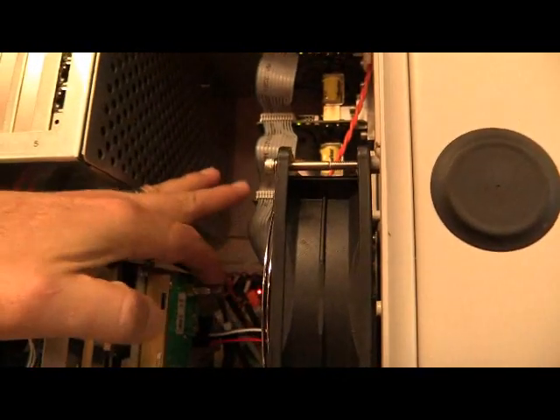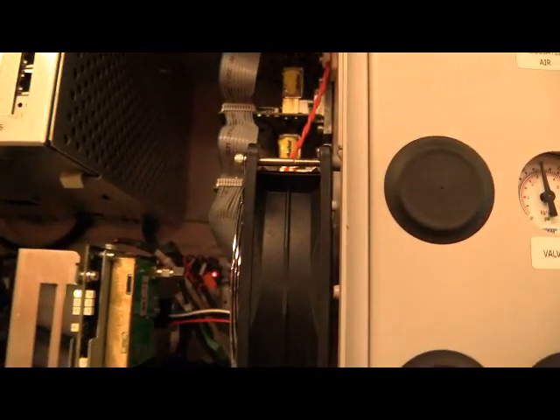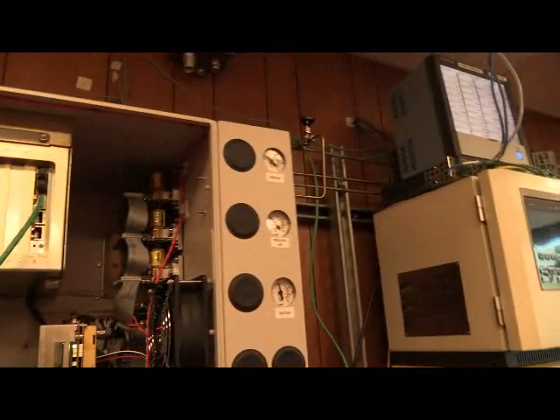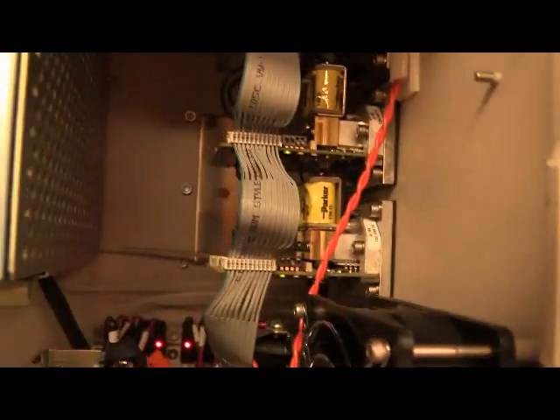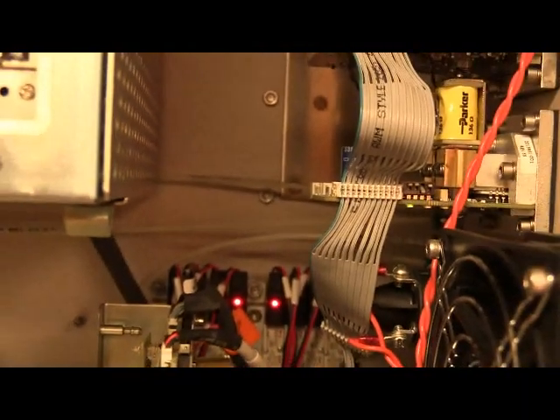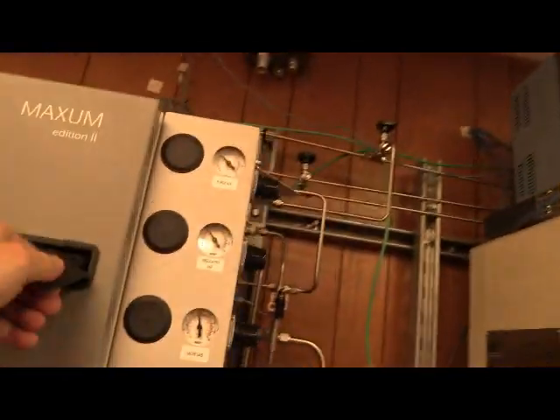That coax right there is a direct feed off of your FID down in the oven. It will interpret that signal and then send it on to let us know exactly what's going on. Our solenoids in the back, those little guys back there firing the valves down in the oven. And in our sample system, there are some more of them over there. That is the electronics compartment.